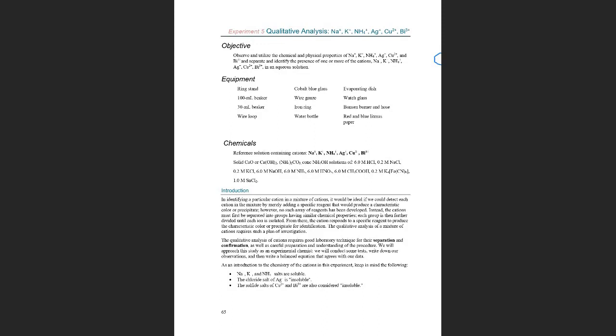And according to the signals or the reactions that you obtained for these 6 reference samples, you will say, okay, I have sodium or I don't have sodium, according to the chemical reaction that you obtain for your unknown. Any questions there?